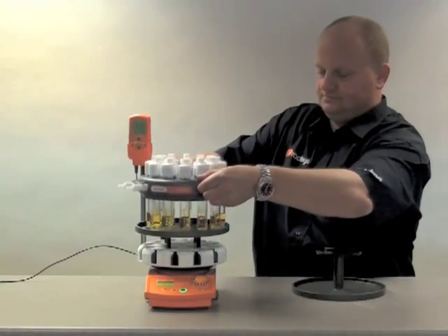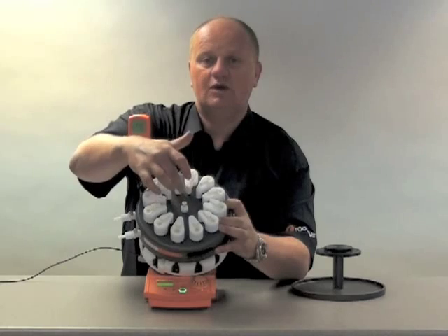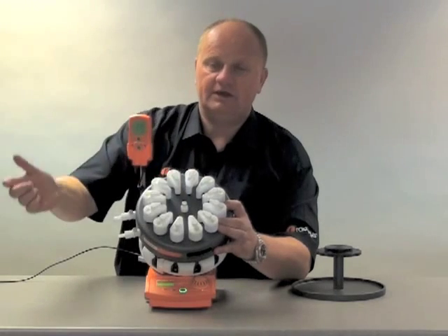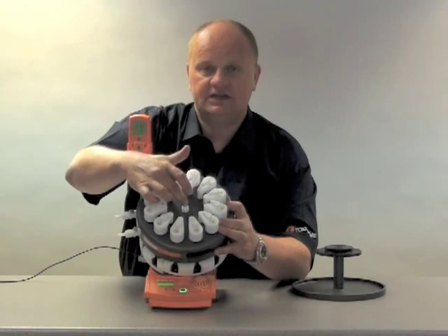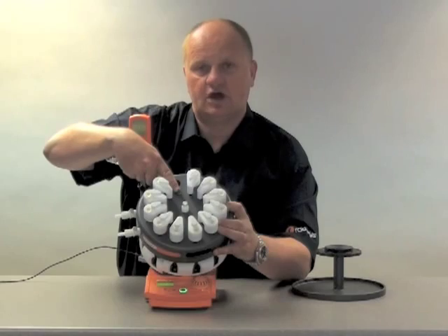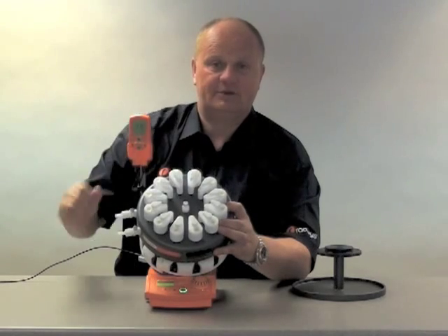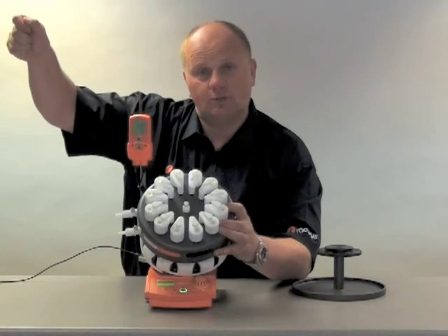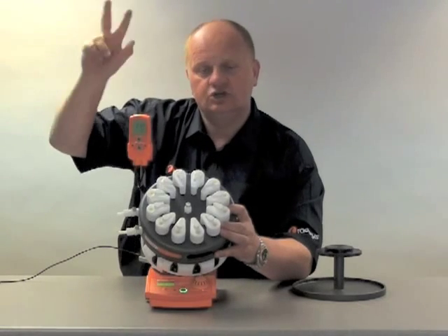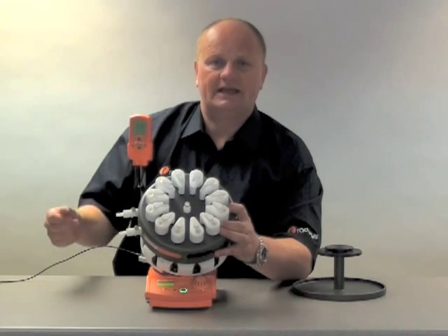If I turn the unit up here, you will see that here we have a central gas inlet. The idea of this is that you can connect this to a supply of inert gas — say argon or nitrogen — and we can feed a blanket of inert gas into the reactors. It goes in here, there's a central chamber and it comes out at each of these outlets here. These are stainless steel, chemically resistant with Viton O-rings on them. If you place a tube, they simply push on and connect in place and you have a gas-tight inert seal. By connecting to a stopcock with a vacuum supply and with an inert gas supply, you can pull a vacuum, flood with gas — do that three times and you'll purge the tube. You then leave it on a slight positive pressure of one or two psi and that ensures a constant blanket of inert gas.